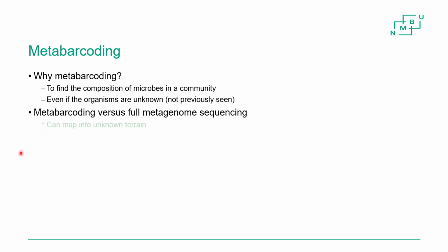Well, here are some. The plus is exactly this. We can map into unknown terrain. So when you're studying environments or microbial communities that haven't been studied very well before, this is the natural first step to take, metabarcoding.